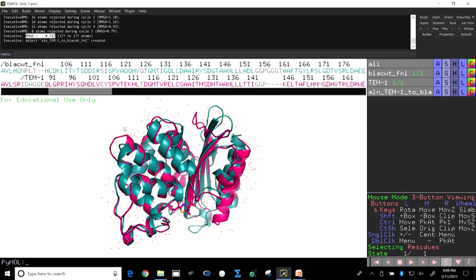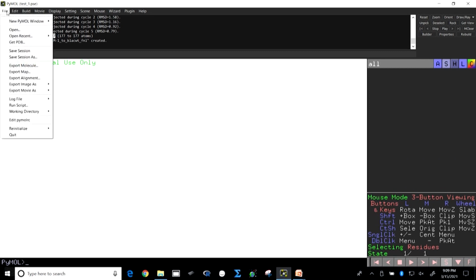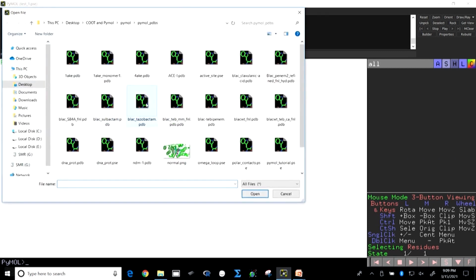So, to demonstrate that, we again come back to the screen and now we will see the mutants. We will also compare between the wild type and the mutant, so that we could have a comparable picture. And as I told, we could have made the picture in WinCoot.